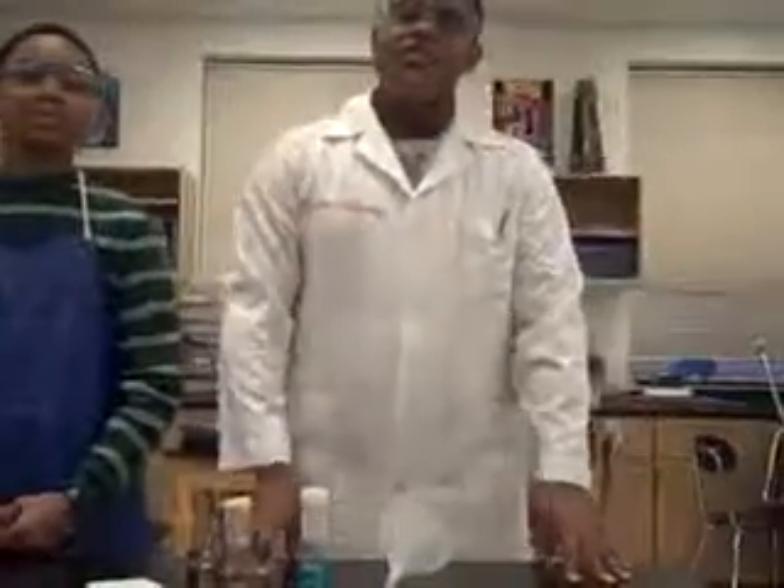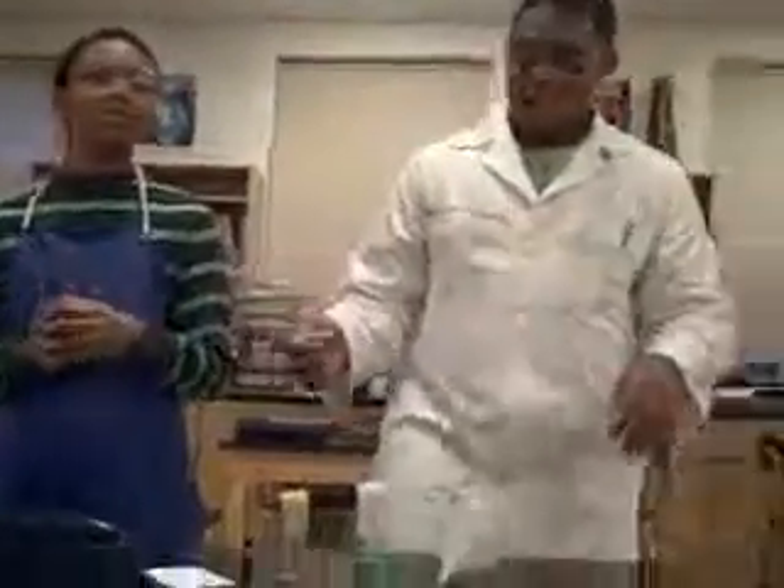Welcome to the Dream Seeker Science Show. I'm the professor and this is my assistant, the assistant. Right now we are going to show you how to anesthetize fruit flies.